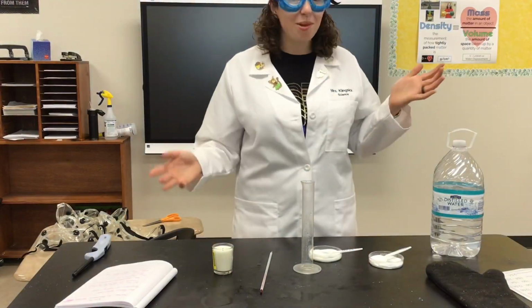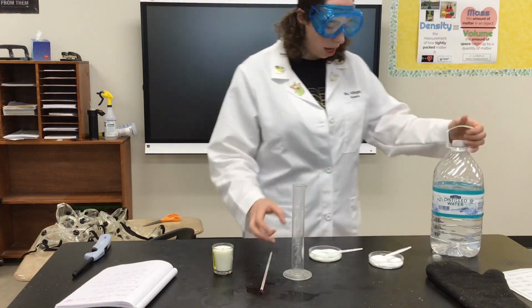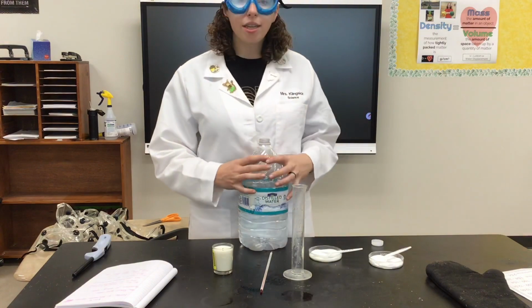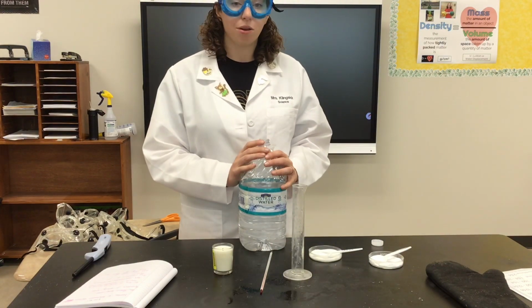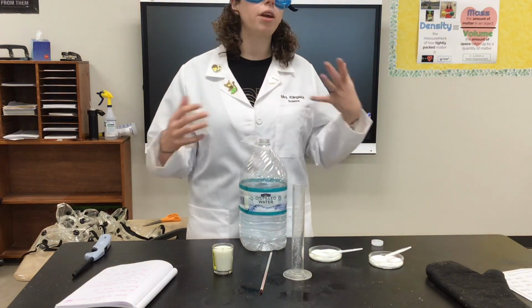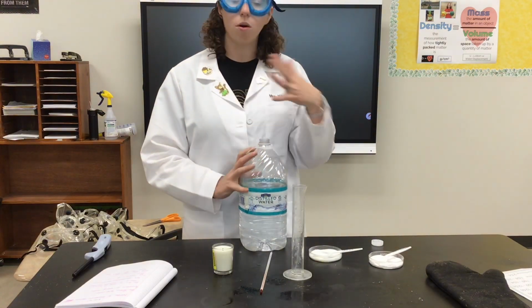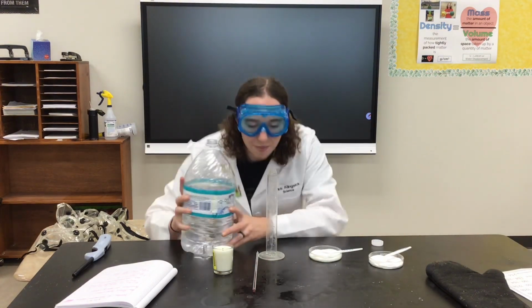Okay, so our first experiment is called the Instacool. So what I have is a graduated cylinder, and I am going to put in here some distilled water. So water is H2O, but water we get from the sink is going to actually have some minerals in it, and that's not a bad thing. Minerals aren't a bad thing, but when we're doing experiments, we want pure H2O. So this is water from the sink that has been purified, so that it's just H2O or water. So I'm going to do about 40 milliliters of water.